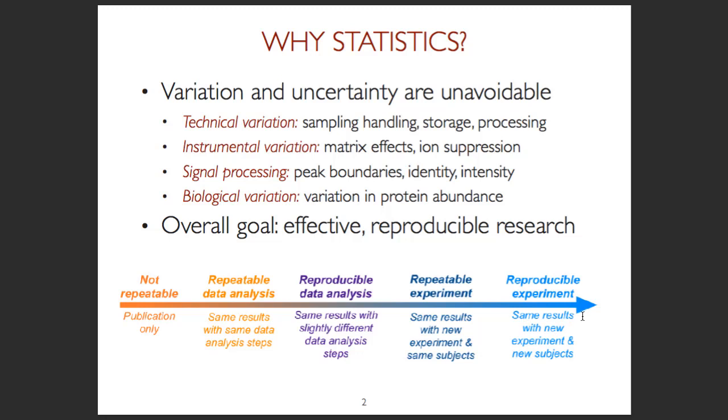And so really all the previous steps are required to make sure that we have the gold standard. And so I would like to argue that statistical mindset actually contributes along the entire spectrum. So in terms of repeatable data analysis, we want to have software which not only automates, but also documents everything that we do step by step.